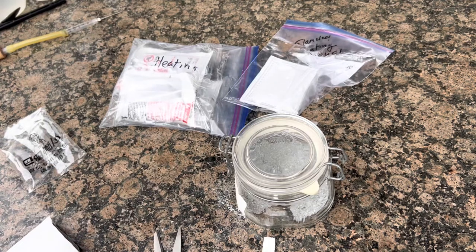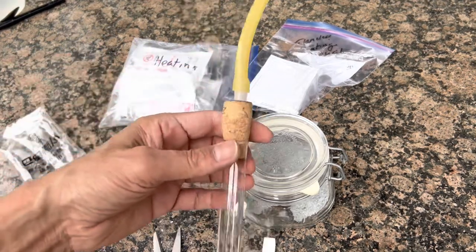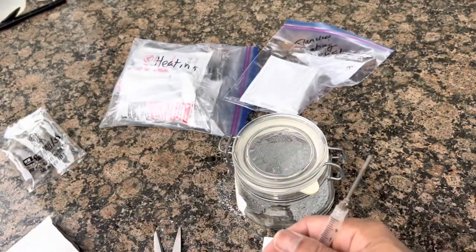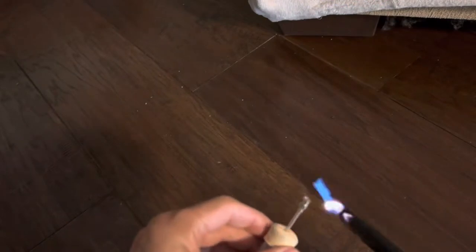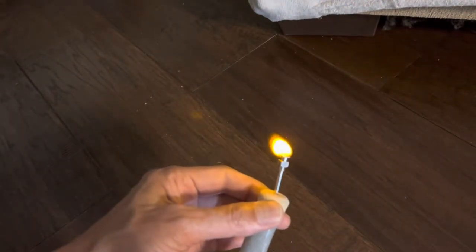Let's do a reaction with a small amount of this. I've got a test tube, a cork, and on the end of the cork I have a setup where I can burn the hydrogen that's generated. Here's the hydrogen burning as you can see there.